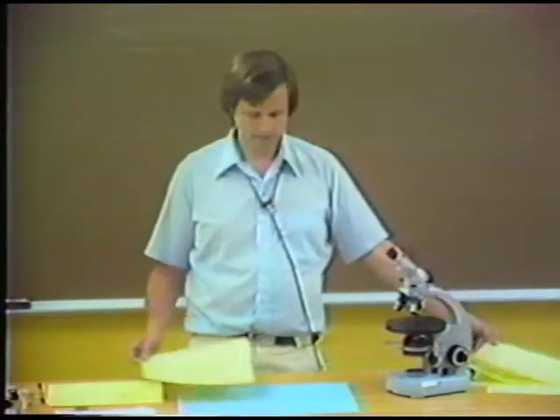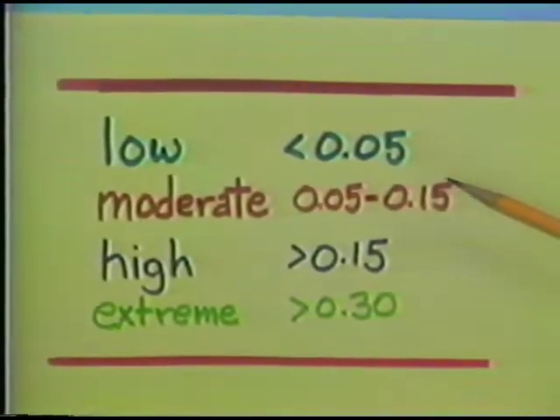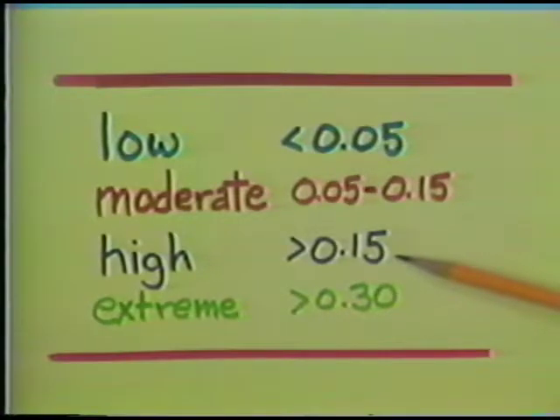This is something we did in the last tape, where we examined really the strength of the refractory effects around the boundaries of crystals, and we made a distinction between some different recognized kinds of relief based on the observation of boundary effects. Low relief, which is characterized by very, very minimal effects around the boundaries of the grains. Moderate relief, where the grains become very well defined. And high relief, when the boundaries become extremely broad and subject to strong refractory effects. Sometimes the grain shows extremely high relief, as most crystals do in air, and we can think of a fourth category of extreme relief, which is actually rarely perceived in most prepared mounts.